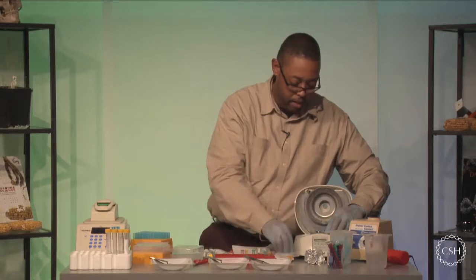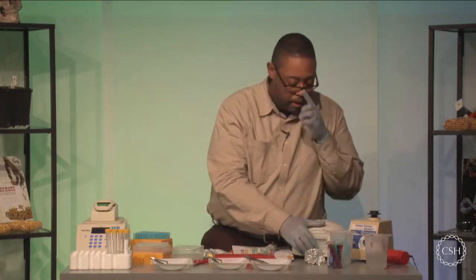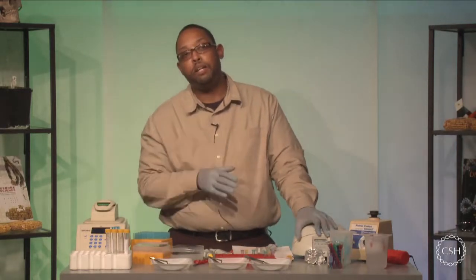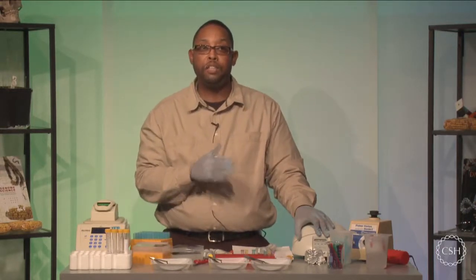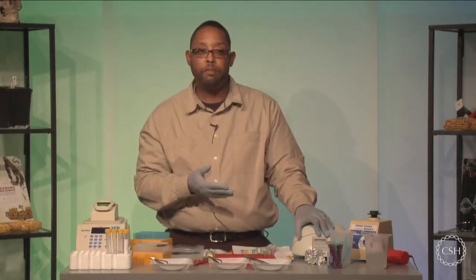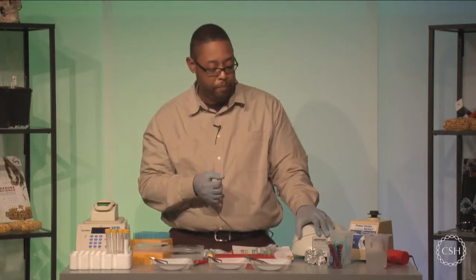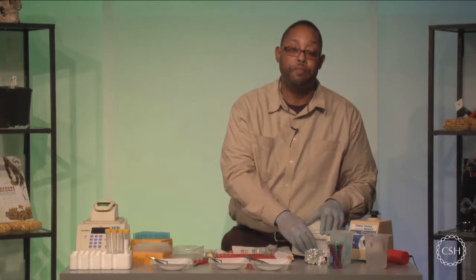and put that into my microcentrifuge and give one last spin. This spin should be substantial so that you pellet as much of the silica resin as possible, because you do not want to carry this over into your final DNA prep, because the PCR reaction is going to have a problem. So spin this down for at least 1 minute at the highest speed that you can get, at least over 8,000 RPM. And this will ensure that all the silica resin is at the bottom of the test tube.